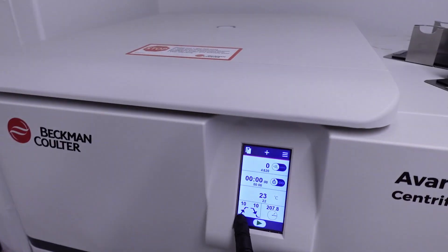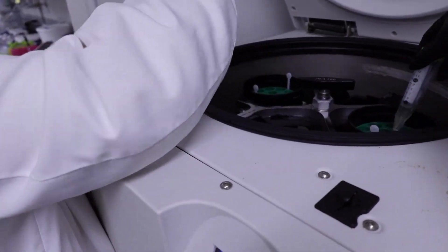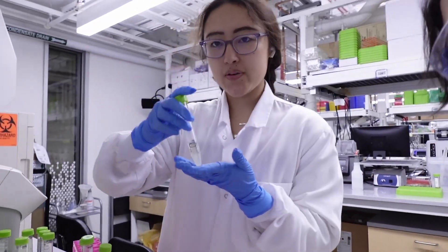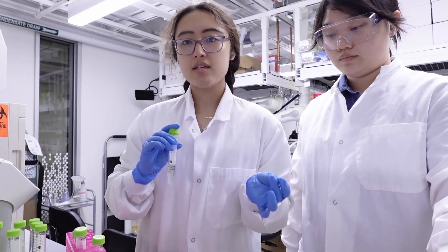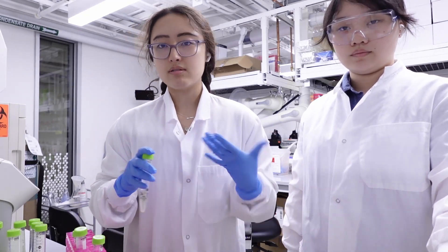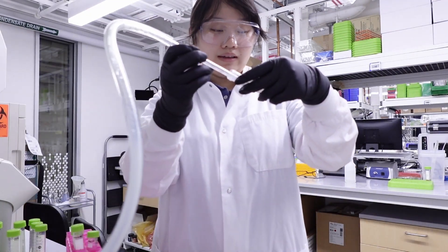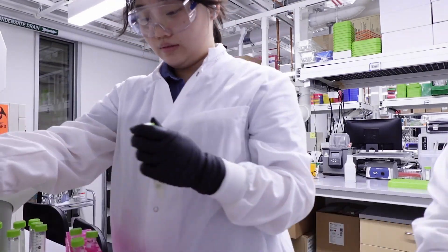We are done centrifuging the cells. You can see the pellet right there — those are all of the cells. And then this liquid is now clear, which indicates that there are no cells in there. The whole point of centrifuging was to pellet out the cells at the bottom. So we're going to basically aspirate the liquid on top, and then we're going to resuspend it in a little bit of buffer with RNase.